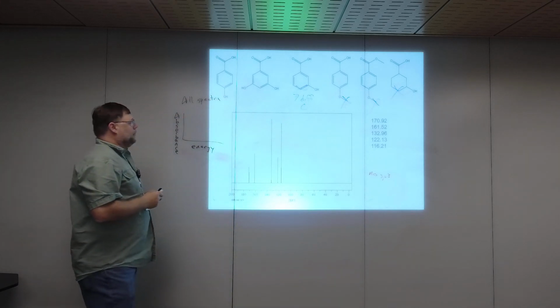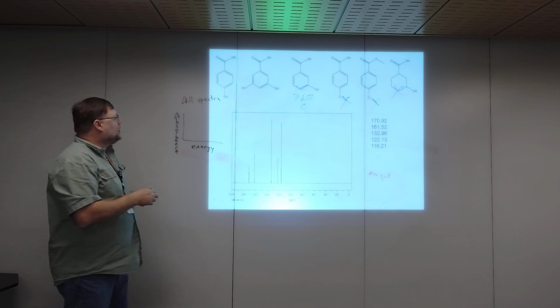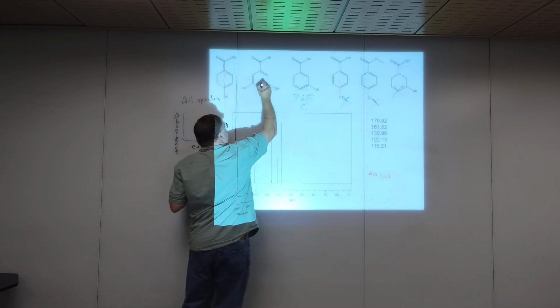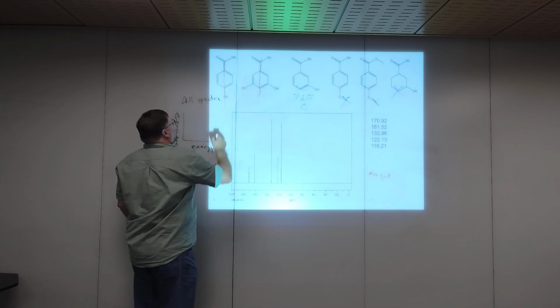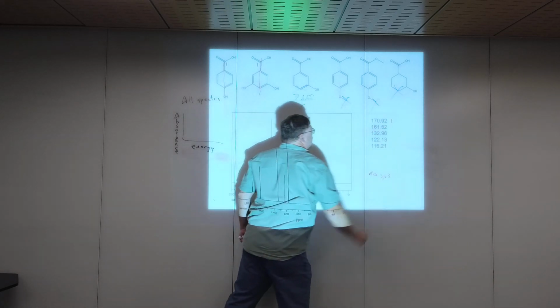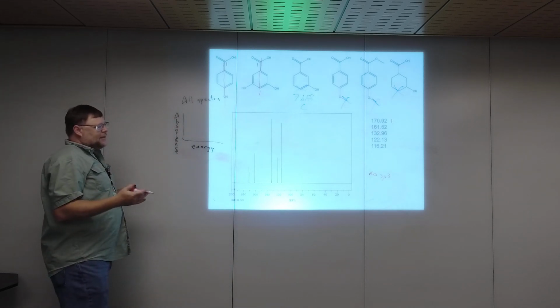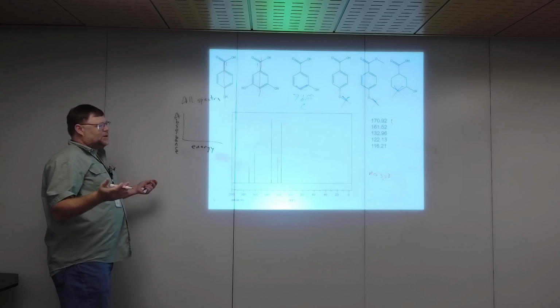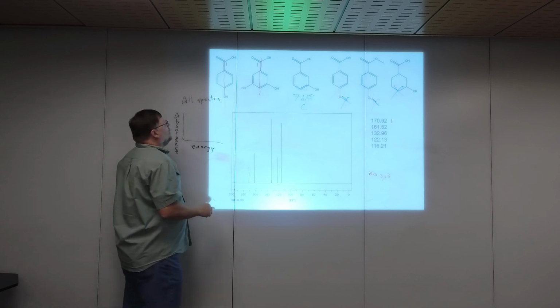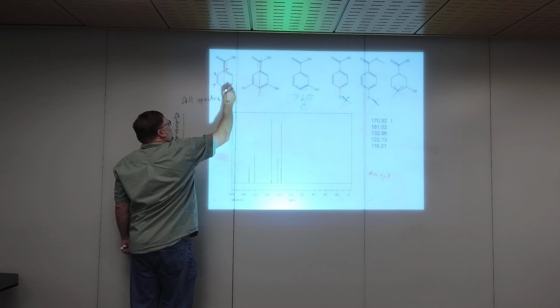How about the other 2? Okay, so again, I erased it for a reason. There's a plane of symmetry here, and it reflects. So 1. We got carbonyls. That 170.9 is probably going to be the carbonyl. The ranges I gave you, they're not like cliffs, right? So I said 110 to 160 and 160 and up. 161 could be an aromatic. It's really right on the border. We've got 2, 3, 4, 5.